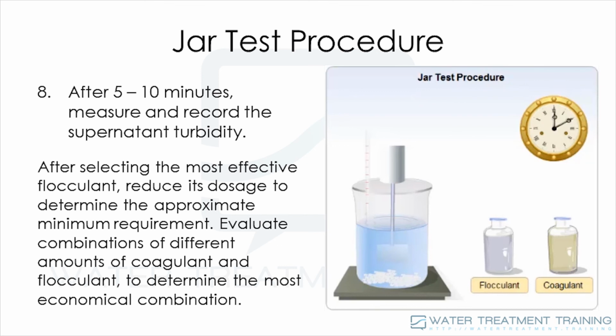In these tests, you may want to add the present planned treatment amounts to establish the first jar as a control sample. Other studies with jar tests may also be carried out to assess the impact of different pH, different mixing energy, or different temperatures on the treatment performance. Remember that you should only vary one parameter at a time.